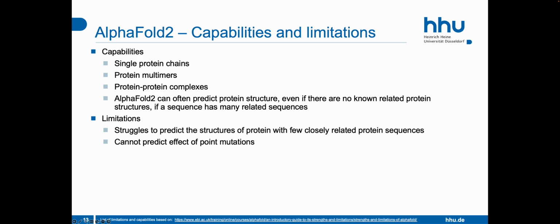Additionally, AlphaFold 2 is not sensitive to point mutations in the protein amino acid sequence. This is because of a lack of data on the effect of variation in the training data. And this also results because AlphaFold 2 focuses on larger patterns within the sequence and is not calculating physical forces between all amino acids and atoms, and hence single point mutations do not make a large difference when applying the AlphaFold 2 model. Proteins are also not static, but they are highly dynamic and undergo conformational changes.